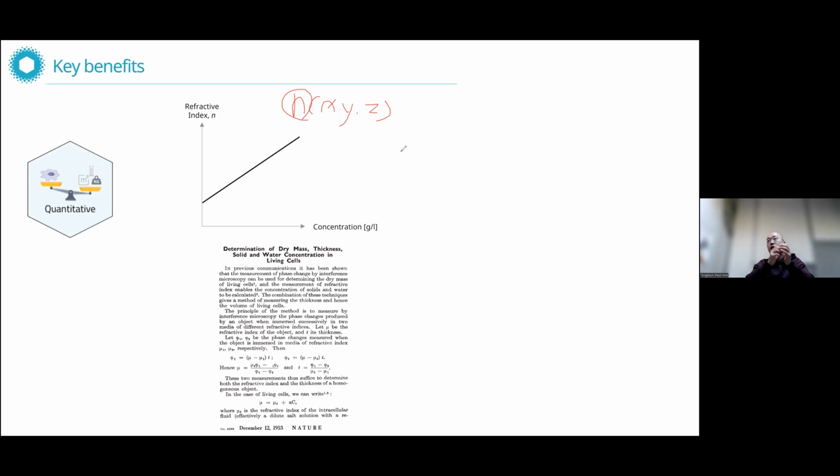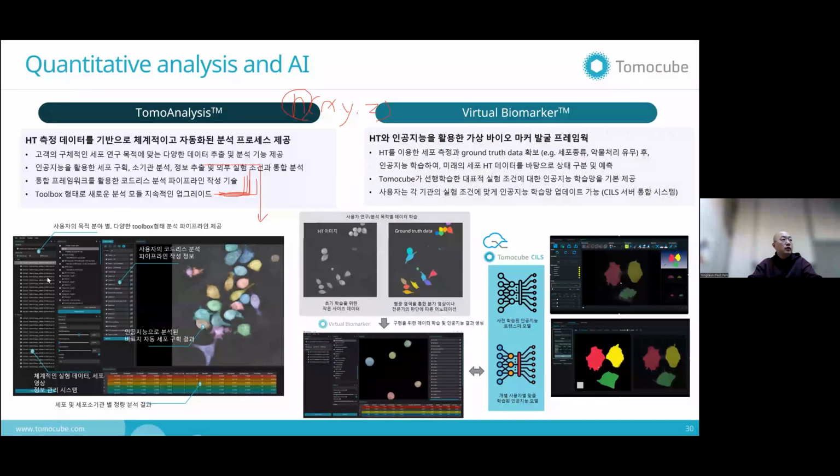This is also related to our potential, because different organelles or different species of proteins have the same slope, which means it is great to quantify the information because the slope is the same for many of the organelles and proteins, but that inevitably prevents providing molecular specific information. So this is why we are trying to, let me just erase this information.